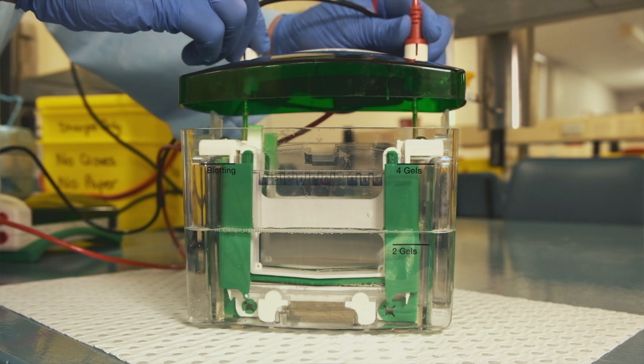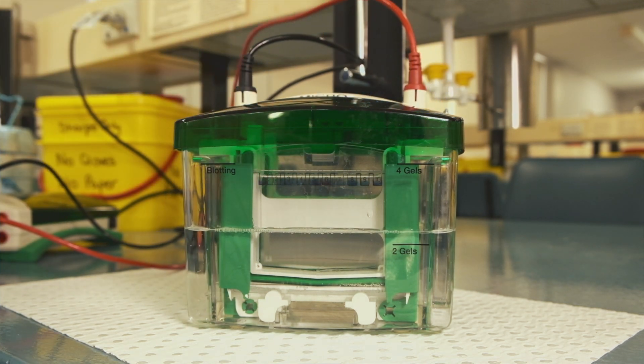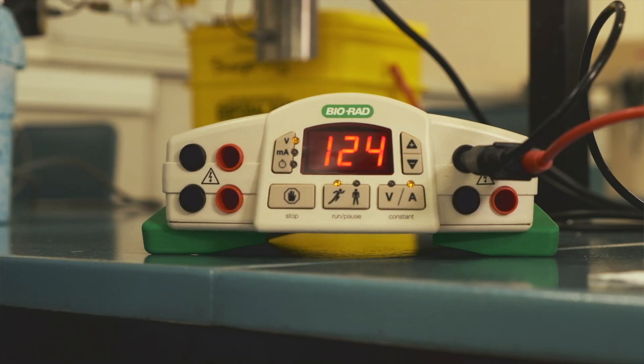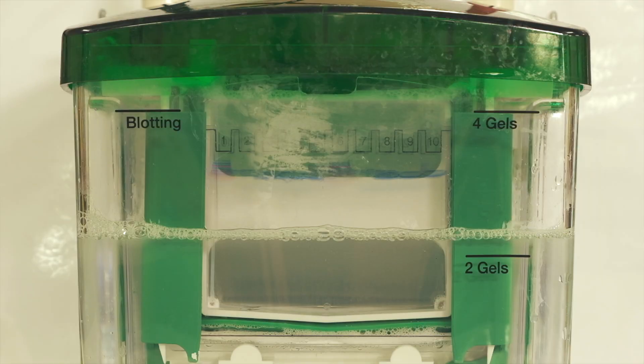Place the lid on the tank, ensuring that the cathode and anode on the tank match those on the lid by checking the colors match. Plug in the connecting cables and run the power at a constant voltage. Depending on the voltage, this gel should take about 30 to 40 minutes to sufficiently separate the proteins in the sample.